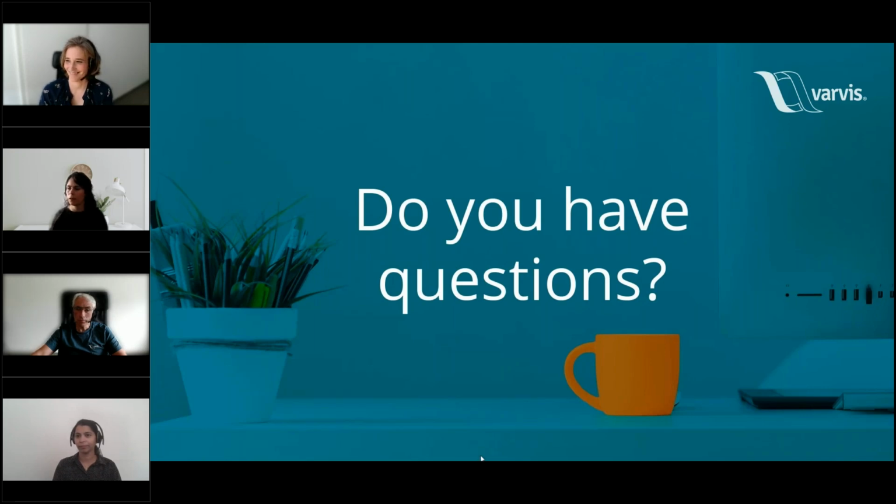We have another question for this part of the session. Can we change or define our own default transcript? Yes. So the user can define the default transcript as we set up the pipeline, but also there is a whole gene management system where you will be able to set your own default transcript on which the variant must be called. But all other transcripts are also available in the variant view like I showed. So yes.